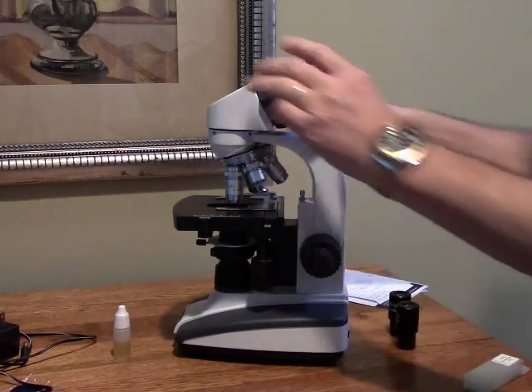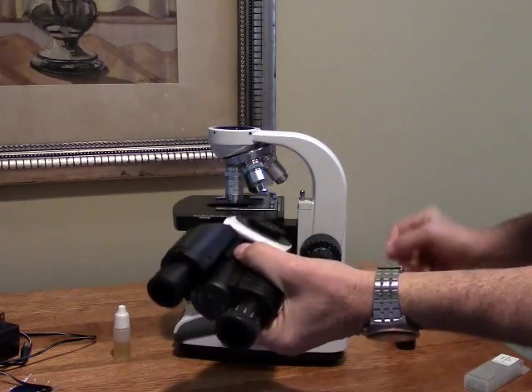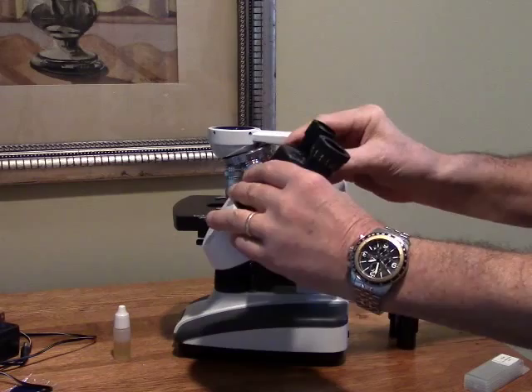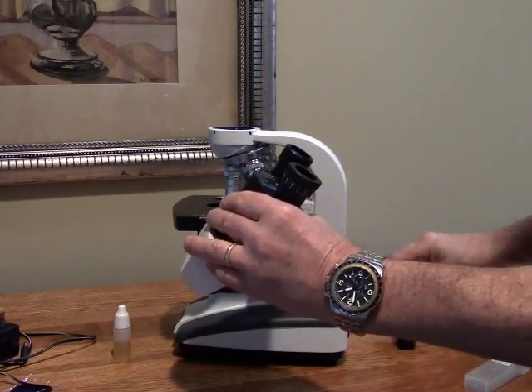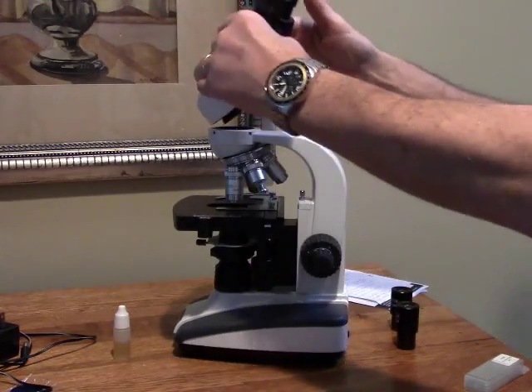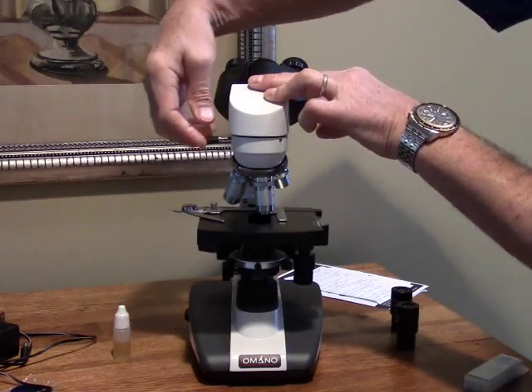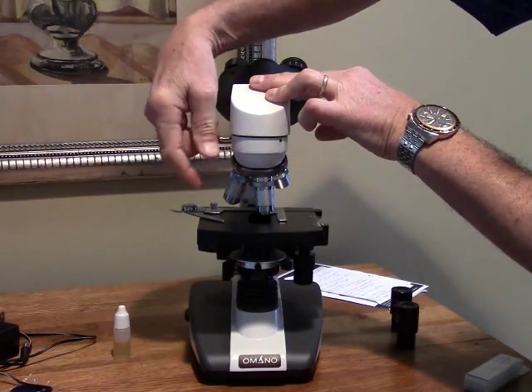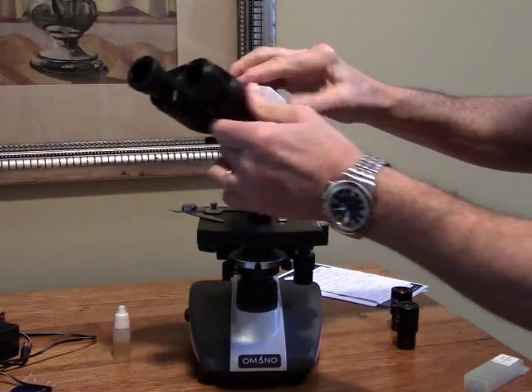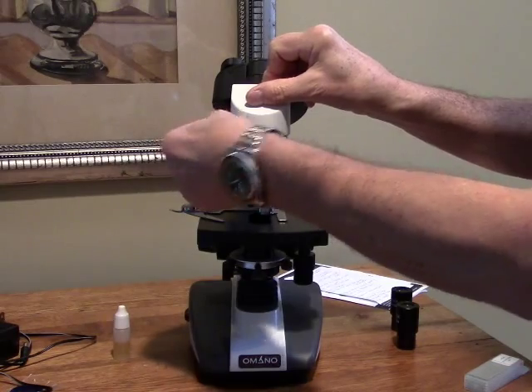The entire head assembly needs to be installed — it's very easy to do, but if you take the head off for whatever reason, you want to make sure you first take the eyepieces out, otherwise they could fall out because there is no set screw. The head installs very easily with a screw you just tighten down, and one of the nice features is it rotates 360 degrees, so you can view from any angle around the microscope.